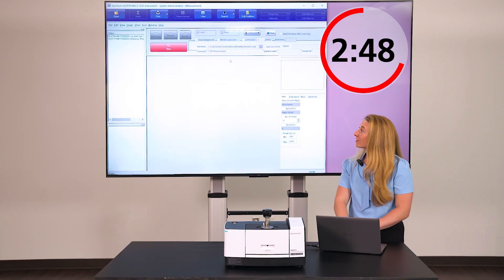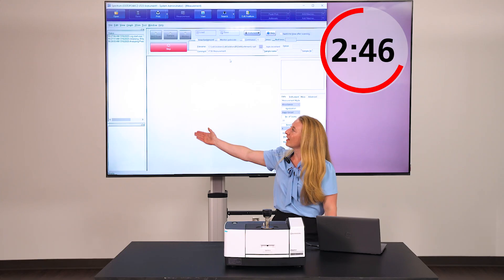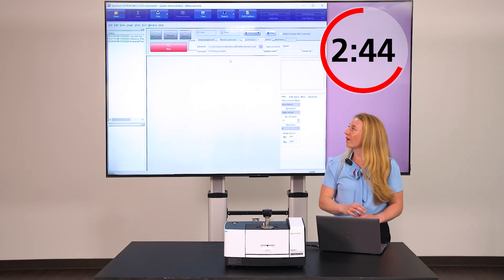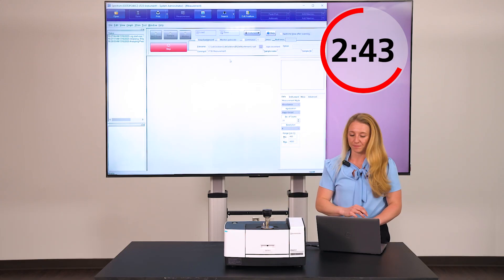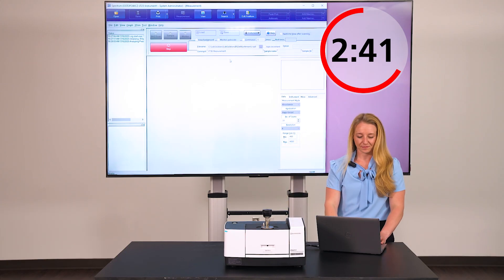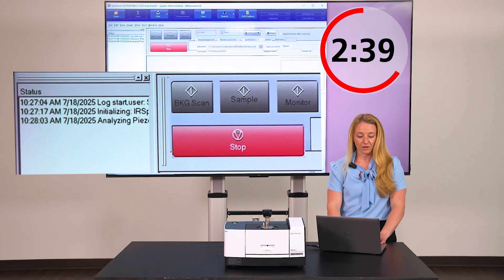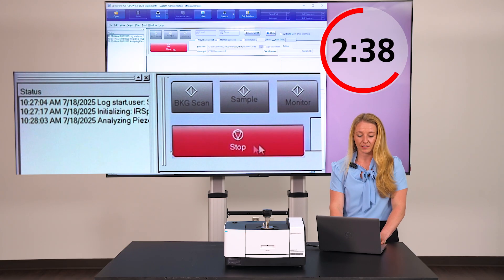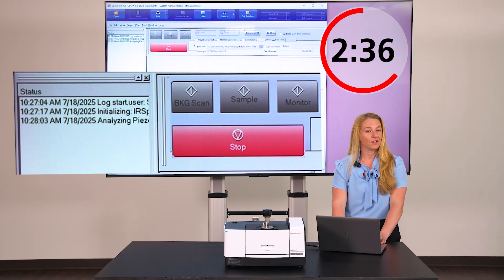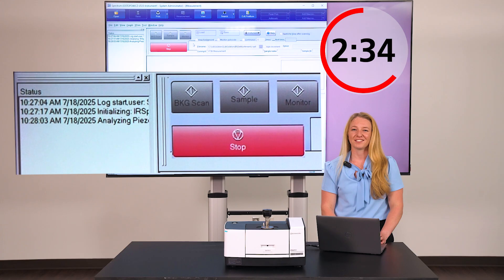Once these checks are complete, they will start to pop up in our status window in the white box over there. Right now, we have background, sample, and monitor all grayed out. Once they turn green, we are ready to run.